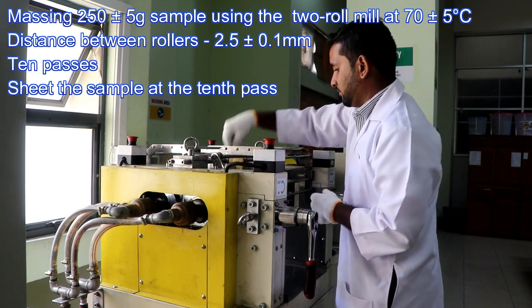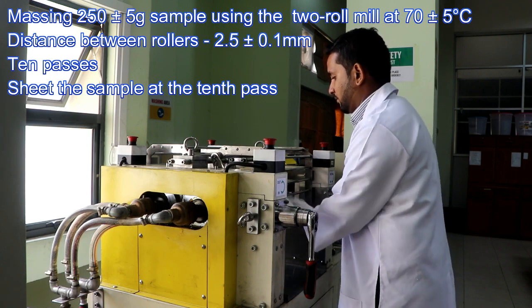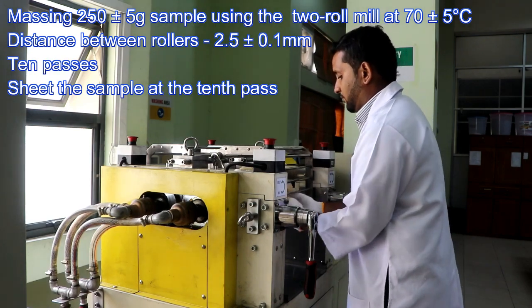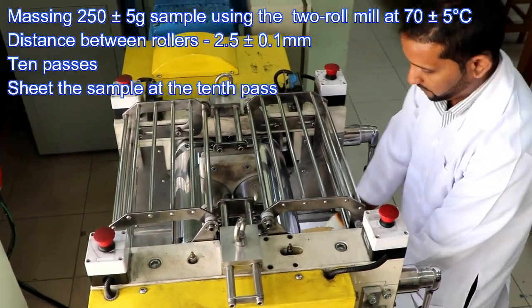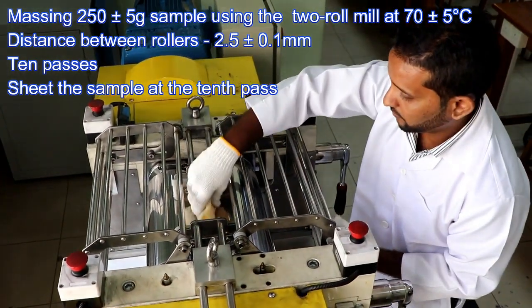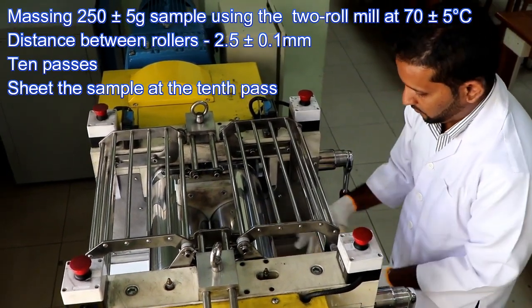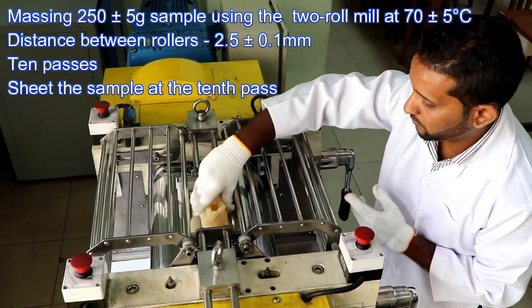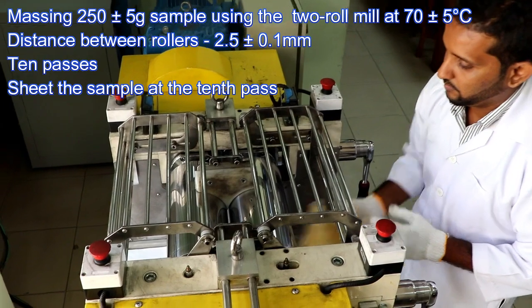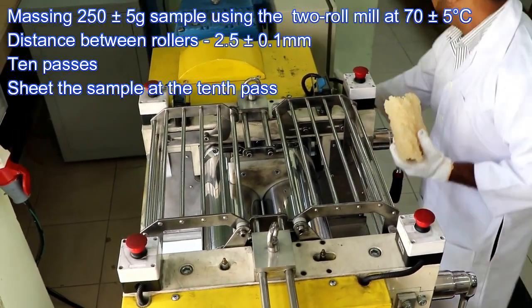When NR samples are mill massed, we have to pass 250 plus or minus 5 grams of the sample between the rollers of the standard laboratory mill. So we have to practice the D3182 method. When we practice this, we have to maintain this temperature. The roll temperature of the mill should be 70 plus or minus 5, and the distance between two rollers, meaning the nip size, should be 2.5 plus or minus 0.1 millimeters.